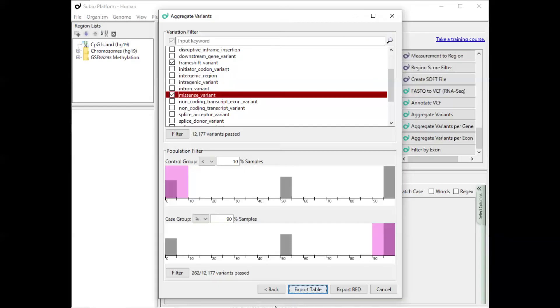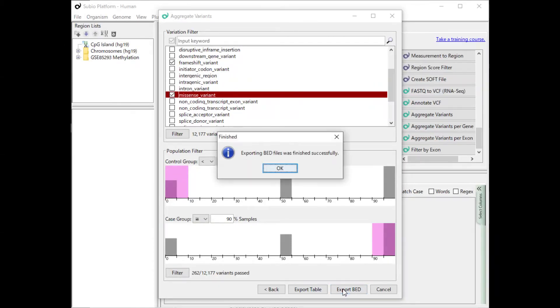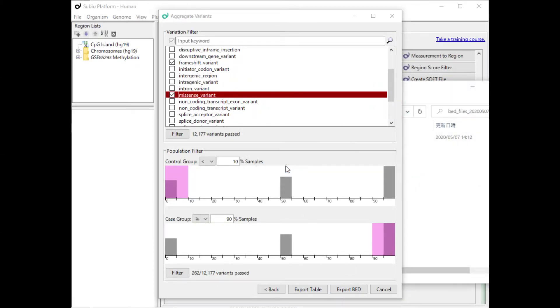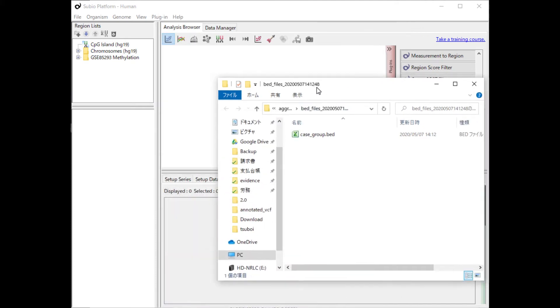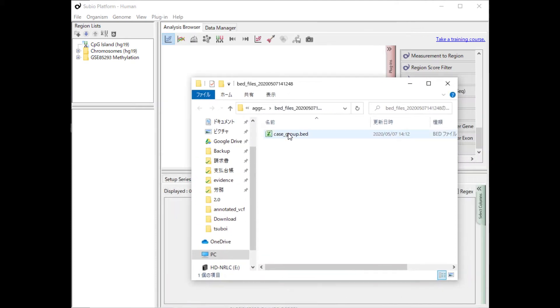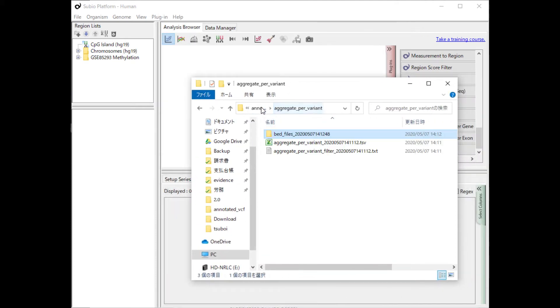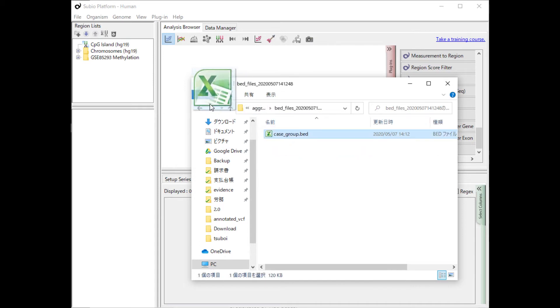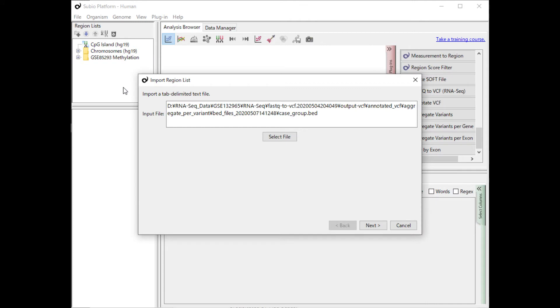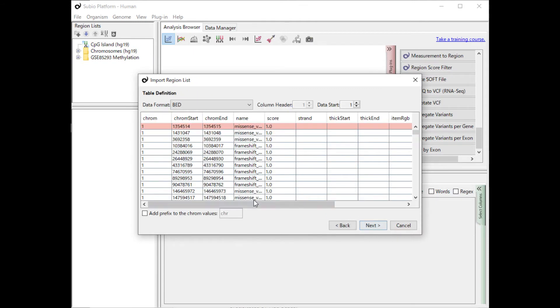Return to the filter screen of the aggregate results and press the Export Bed button. You can find the output bed files in Bed Files folder under Aggregate Variant Folder. Import the resulting bed file as a region list. Please use the option to add prefix.